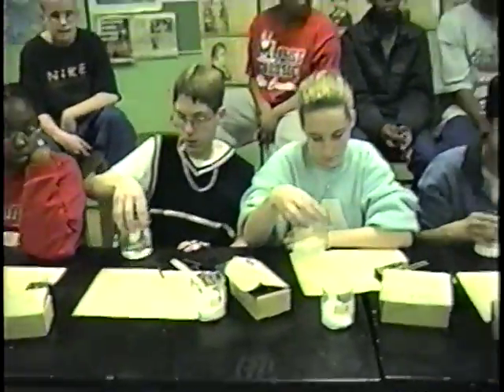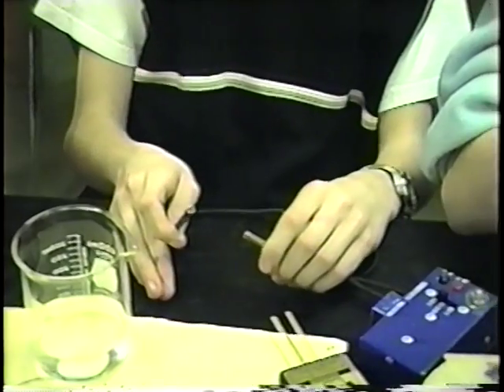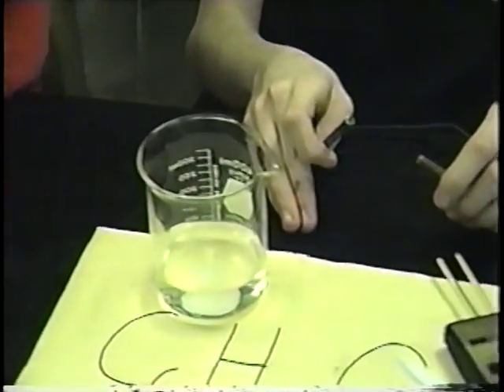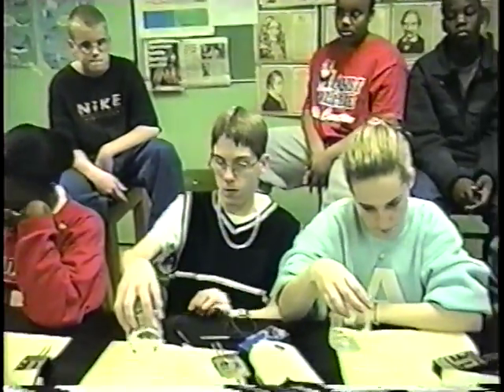Now, they all work exactly the same way. They're all broken at their electrodes. Kyle, if you could hold up your two electrodes and show us where it's busted on the blue box. Right there. In order for this to work, electricity has to go into one of those electrodes, through the solution that you have made here, if you did make a solution, back into the other electrode, completing the circuit. How will we know if the circuit has been completed? If the light lights up.